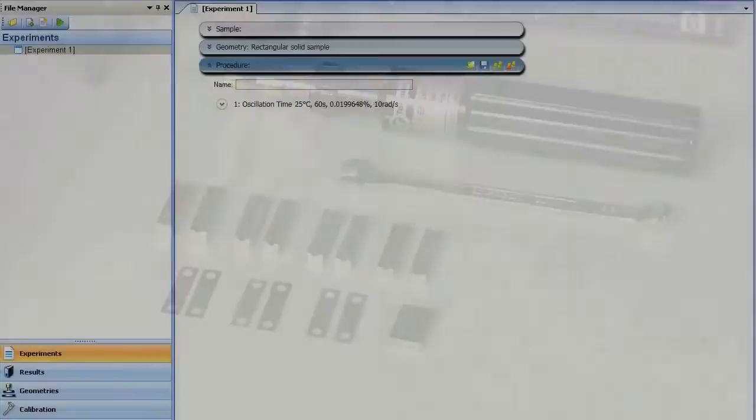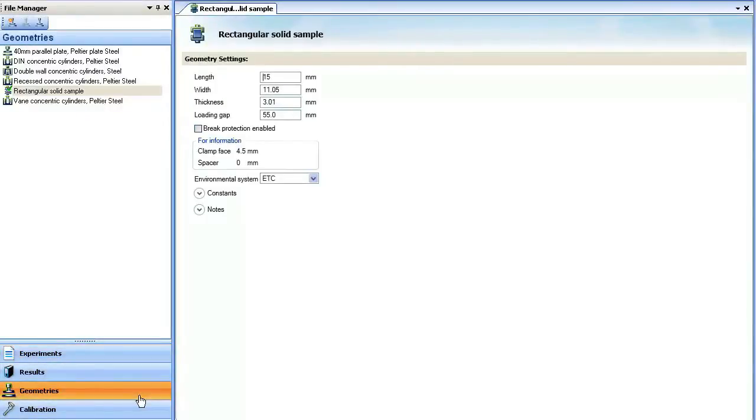After installation of the upper and lower geometry, go to the Geometry tab in TRIOS and open the Geometry Settings window. Measure and enter the appropriate dimensions of the steel bar used for compliance.